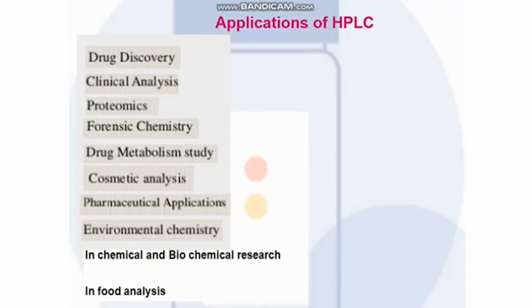The applications of HPLC are very vast. The major applications are in drug discovery, clinical analysis, proteomic studies, forensic laboratories, drug metabolism studies, cosmetic analysis, pharmaceutical applications, environmental studies, chemical and biochemical research, and also in food analysis. These are the major applications of HPLC.